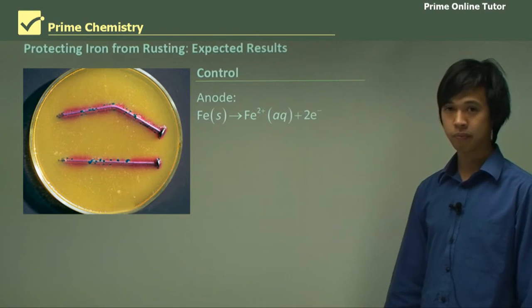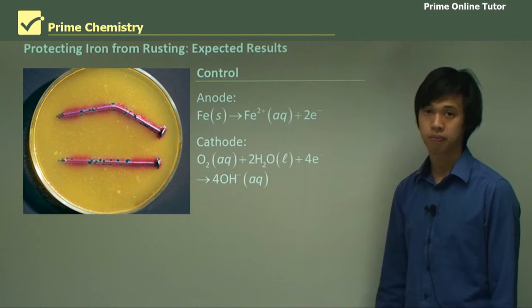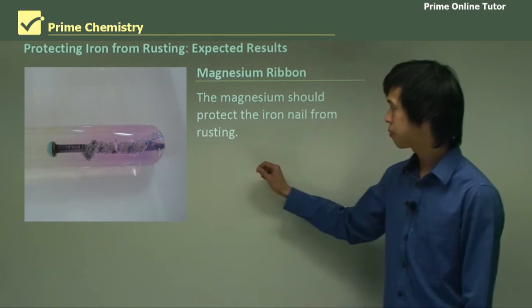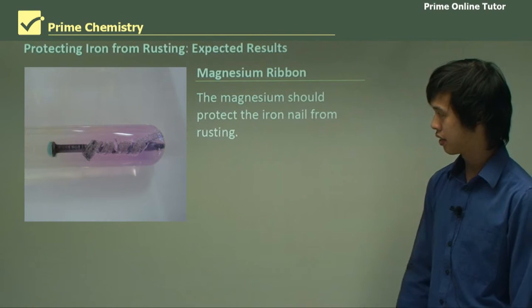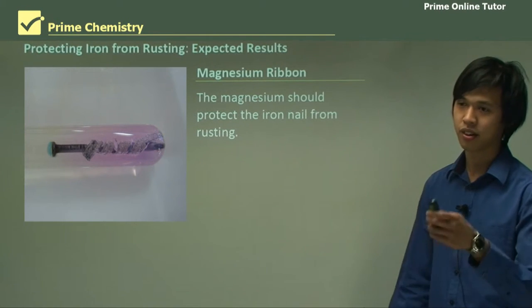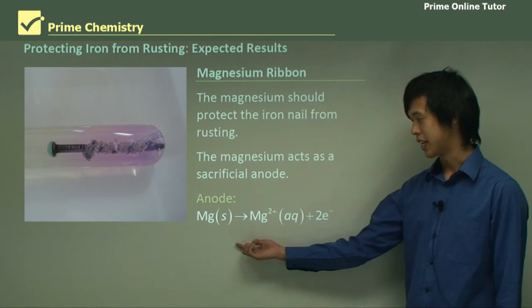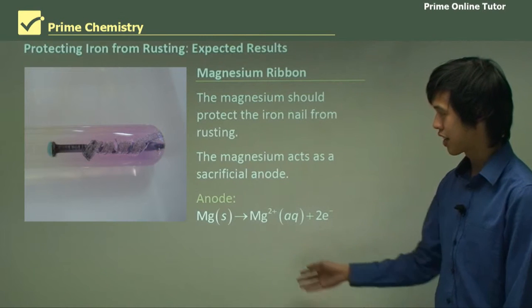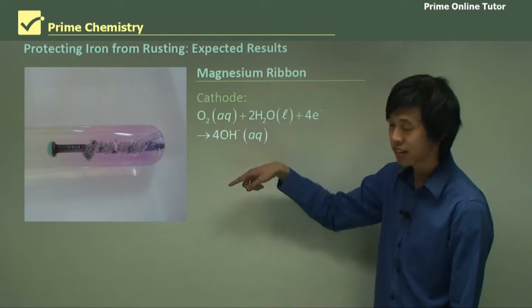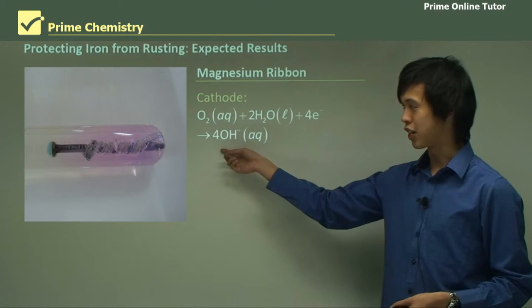At the anode, the iron oxidation reaction is happening — that's why it's blue. At the cathode, the reduction reaction is happening, producing lots of OH⁻, which is why it's pink. Now if you look at the magnesium ribbon, you can see there's very little blue. That's because the magnesium is protecting the iron nail from rusting — except right at the very end, where the electrons can't quite get that far, so it's corroding a little bit. So the magnesium acts as a sacrificial anode: magnesium solid goes to magnesium ion plus two electrons. At the cathode, those electrons are reducing the water to give you OH⁻, which is why you can see so much pink.